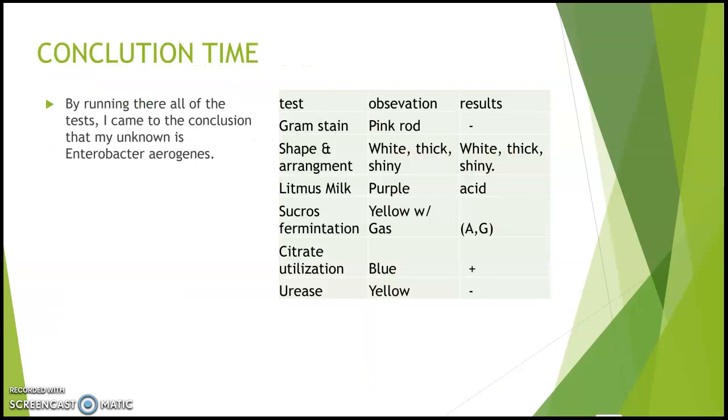After taking the time to look at all of my tests, especially my last 3, I was able to come to the conclusion that my unknown was Enterobacter aerogenes.